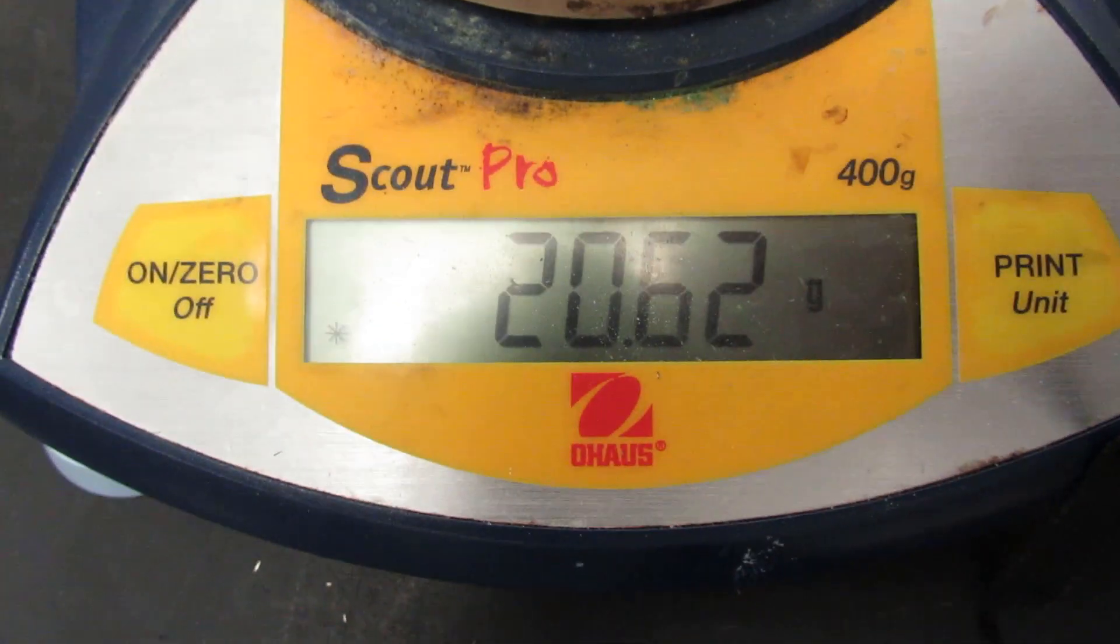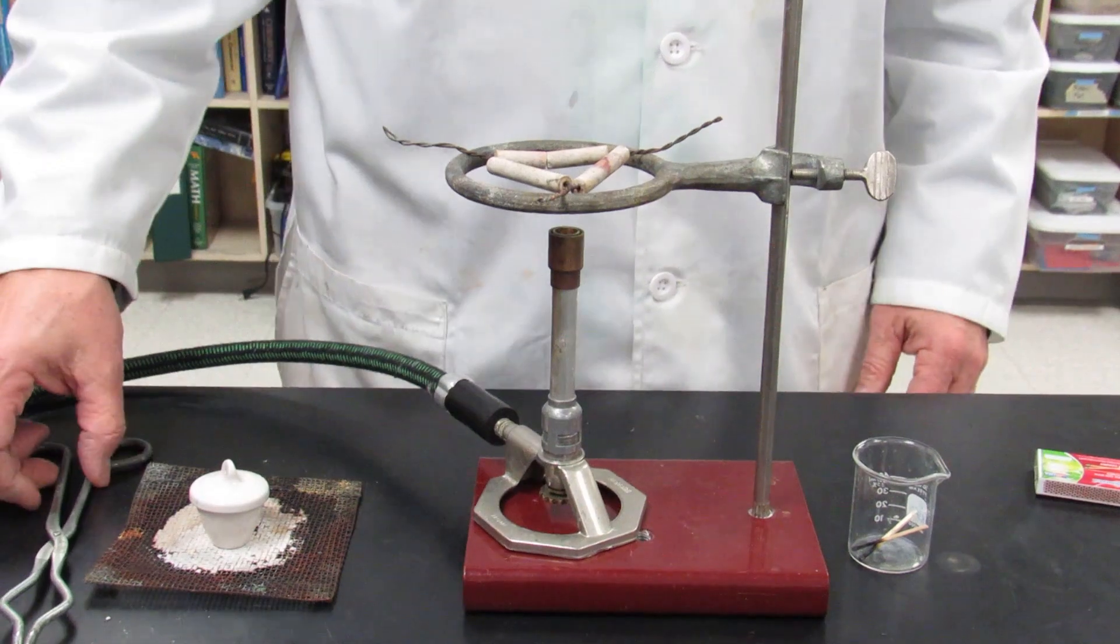Add the lid and then record the mass. The mass of the crucible cover and the magnesium is 20.63 grams.